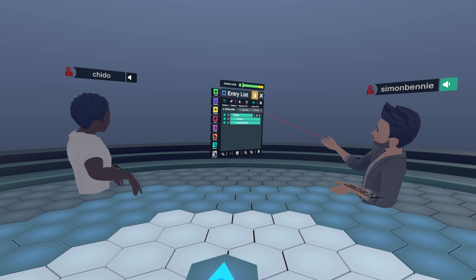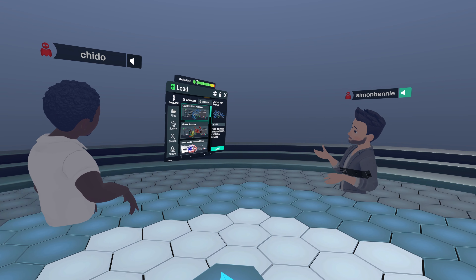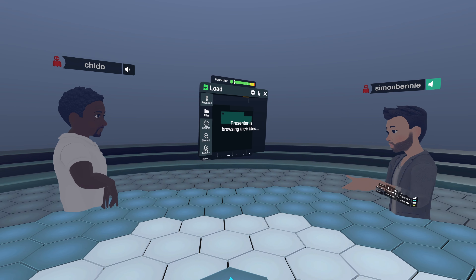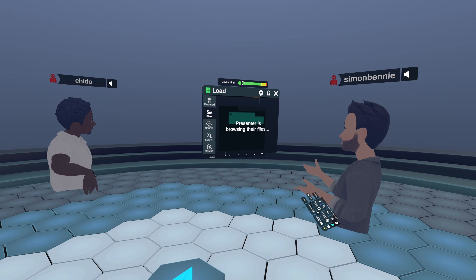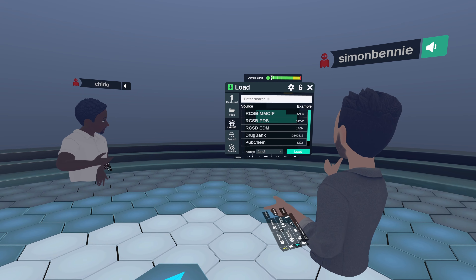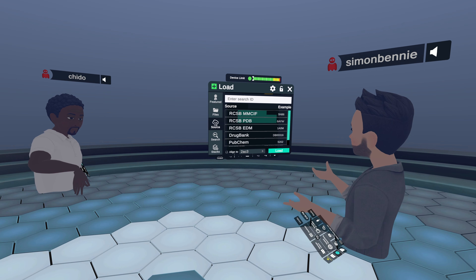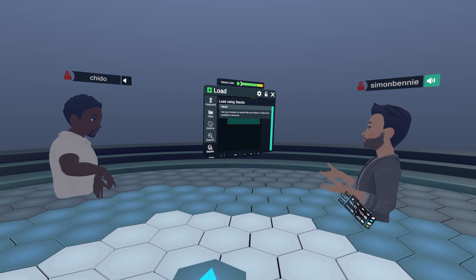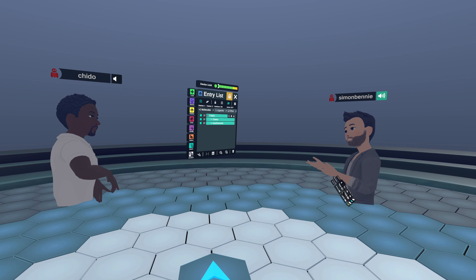Nanome puts loading structures front and center, so we have a load menu that lets you pull from a number of different sources: files on your headset, the hard drive of a PC if you're cabled into PC VR, an online database such as the RCSB database using just a PDB ID, the built-in web browser, and the vault — that distributed file system hosted on the Nanome cloud. A final way to get structures in really easily is using Quick Drop.